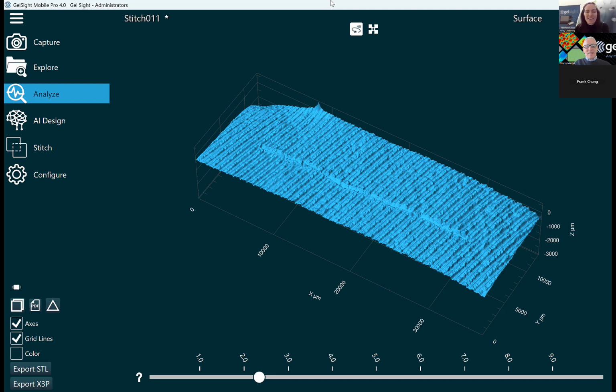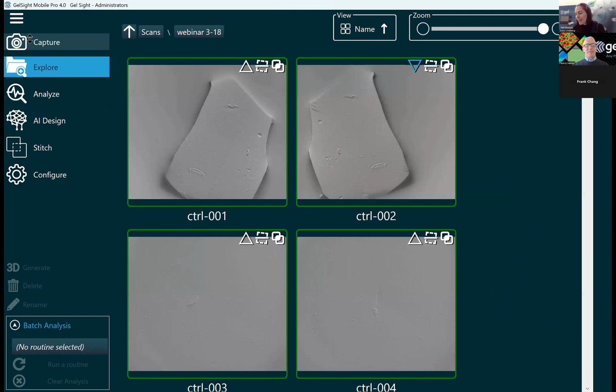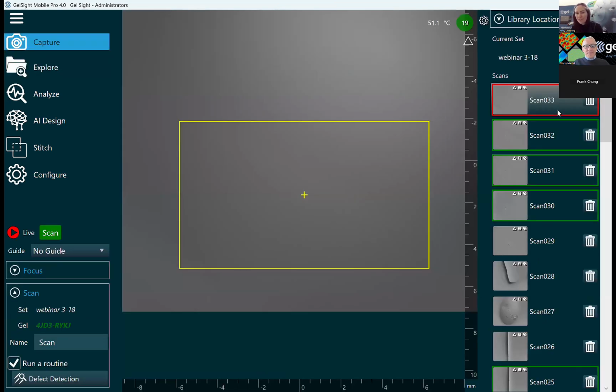So the first question we have in here says, how accurate is the scratch function going to be with selecting such a large reference area to the high and low points? So I'll just check answer live. I think that's referring to the scan that we did with the scratch function. I'll just open that up on the shared screen here. Let me go to this one. There we go.